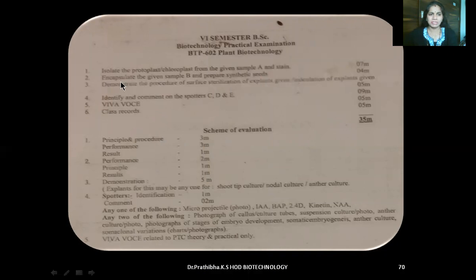Then question number 3: Demonstrate the procedure of surface sterilization of the given explants. Or you can also do inoculation of the given explants. This question carries 5 marks. Here, any one explant can be given, that is shoot tip or nodal or maybe anther.